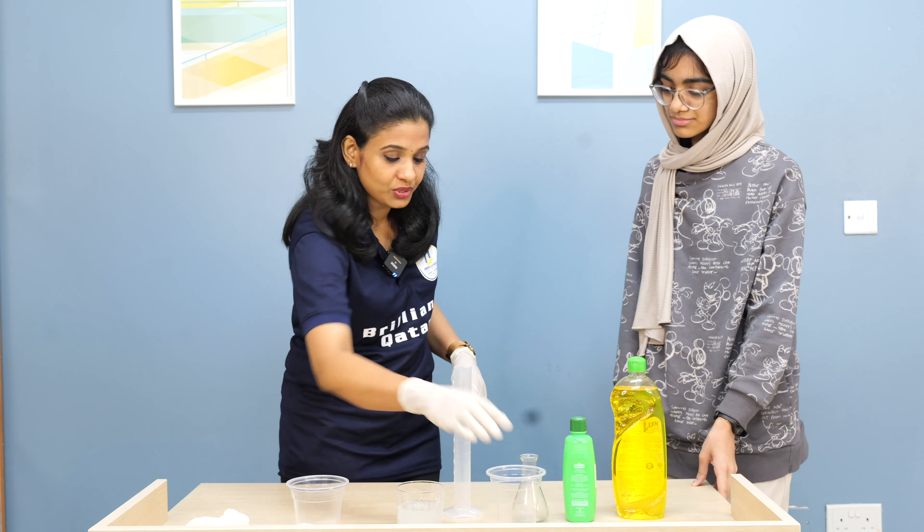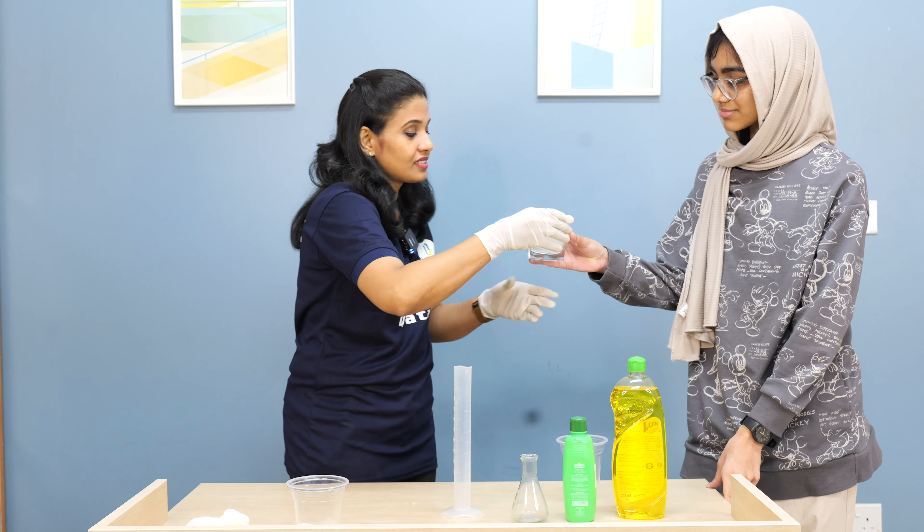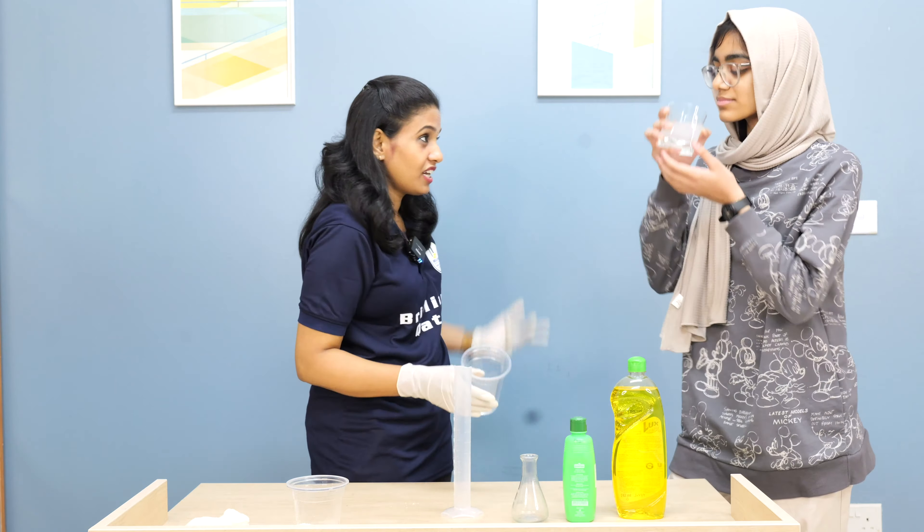We are going to gargle the salt solution. And I have to spit it in this place. Gargle it thoroughly, so that we can collect the cells.